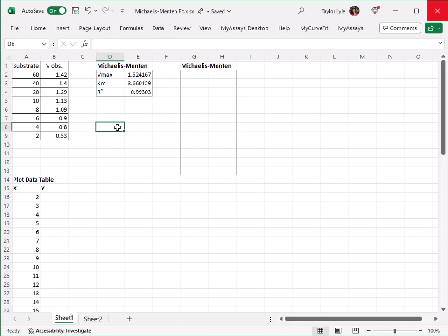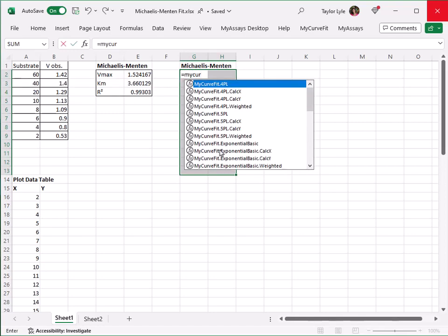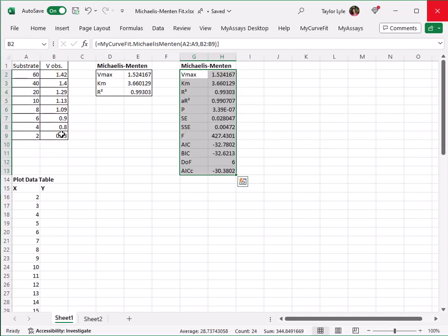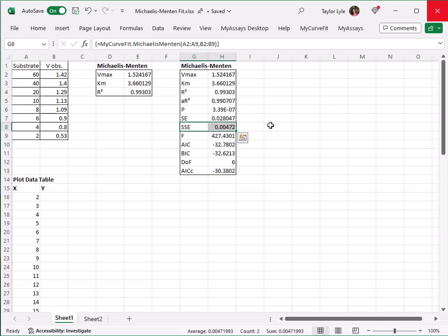If we'd like to see additional goodness measures, including the squared sum of error, we can highlight more cells when calculating the curve fit parameters. I'll highlight this block of cells, and again enter equals MyCurveFit, select the Michaelis-Menten option, highlight my calibrator X and Y values, and press Control-Shift-Enter. You can see the additional goodness measures that have been added, including the SSE, which is quite small for this dataset.